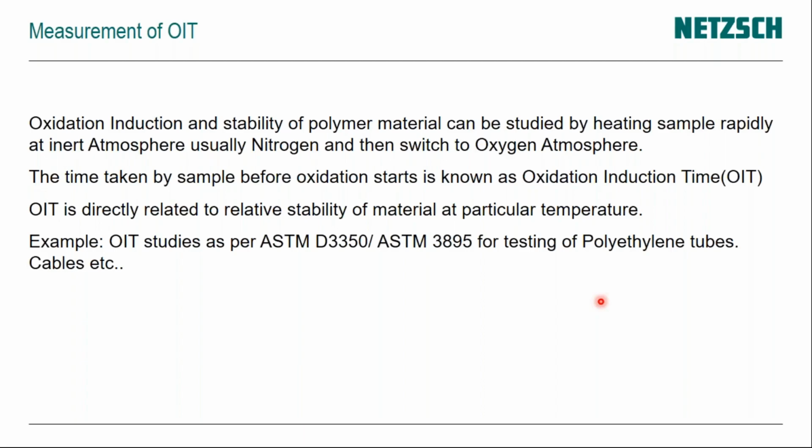Now this OIT is directly proportional to the relative stability of the material at a specific temperature. So that's why OIT is one of the most important tests used by certain industries, as I mentioned, telecom industries.